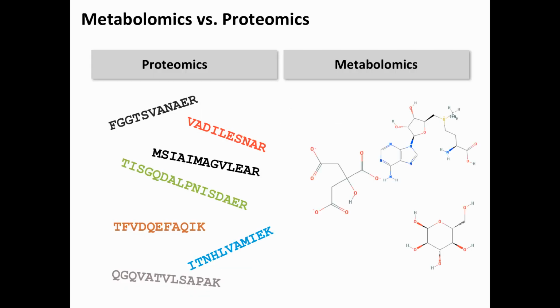When we compare proteomics and metabolomics, then the world of metabolomics is much more diverse. We are dealing with structures, no longer with linear sequences. We are dealing with very different ways in which metabolites can fragment. We will discuss that in a minute.